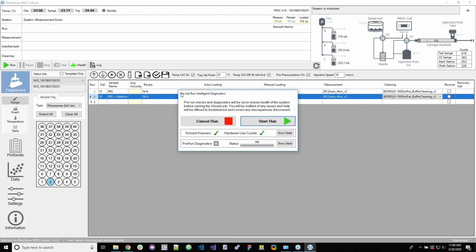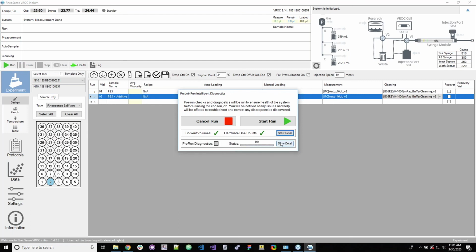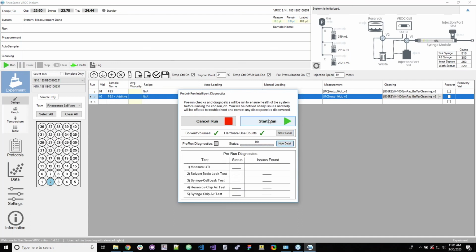So here, this is the pre-job run intelligent diagnostics. So when you first click run, it will say, okay, the pre-run checks and diagnostics will be run to ensure the health of the instrument before it runs the job. And then if there are any issues, it will notify us. So it looks like the cleaning solvent volume is okay and the hardware use counts are okay. So we can go and look at starting to run.